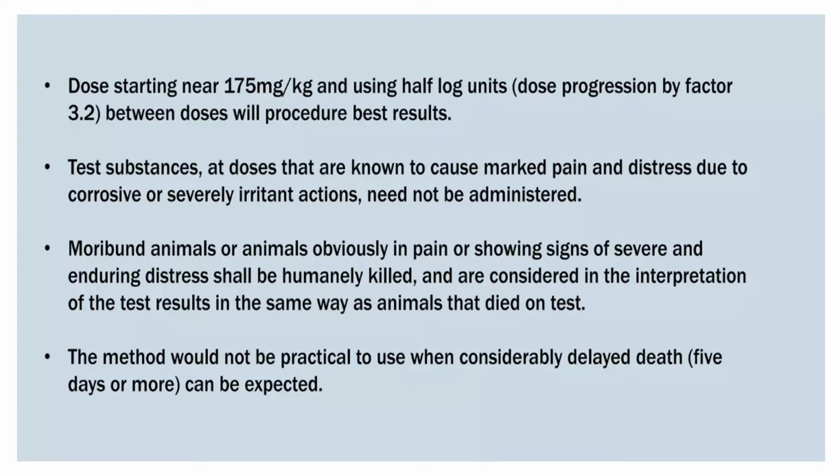You have to give only one animal the 175 mg dose, and after that you have to wait for 48 hours. You have to see the symptoms, how the dose is affecting that animal, and what happens if the animal dies or survives.